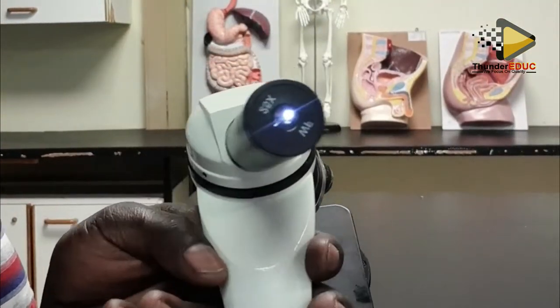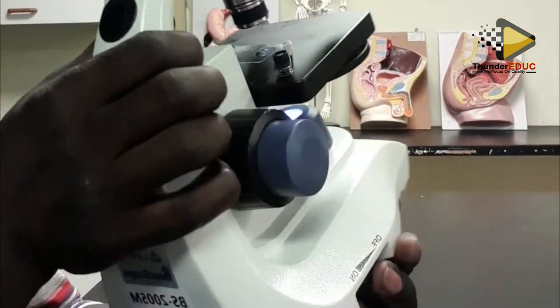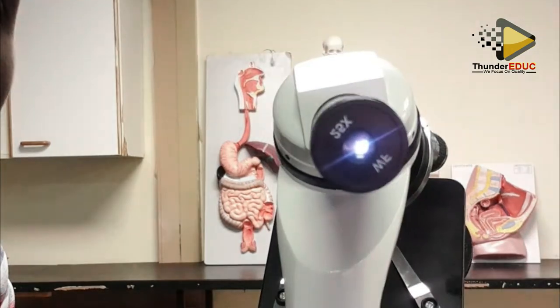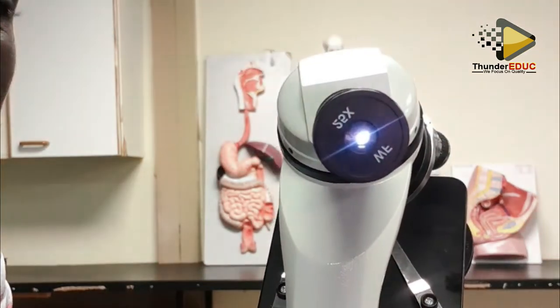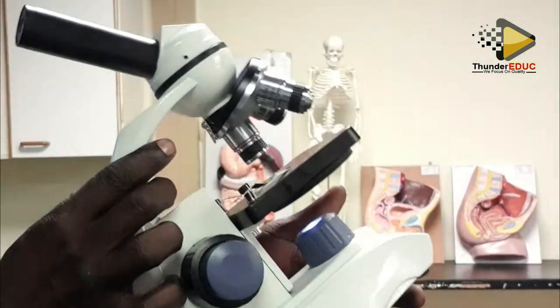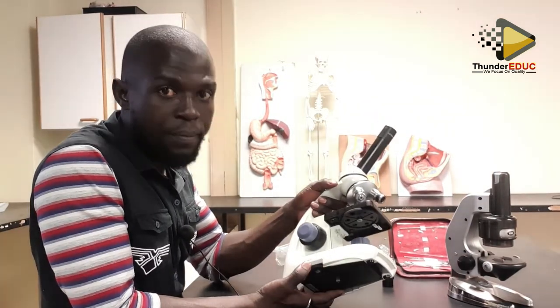You see the light is coming from this side now. If you put your eye here, you're able to see. If the light is too much, you try to reduce the light. Now you see here, the light is too small. But if I try to increase, now you see the light is too much. But if I reduce, you see the light is too small. So that's how it works. You can also change the condenser or the diaphragm until you get your perfect amount of light entering the eye. That's the advantage: this can increase the light, and sometimes it reduces the light.